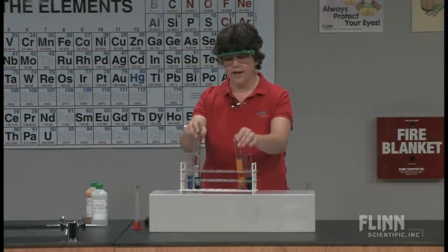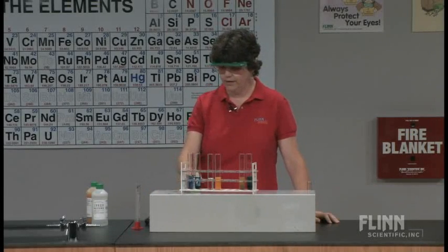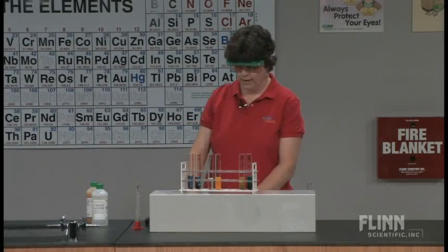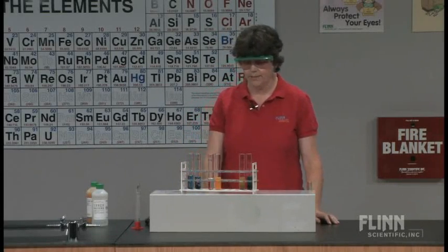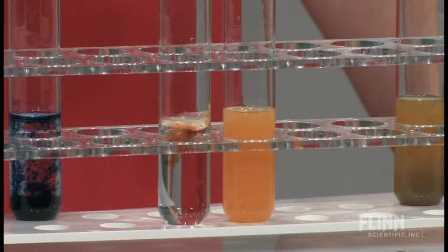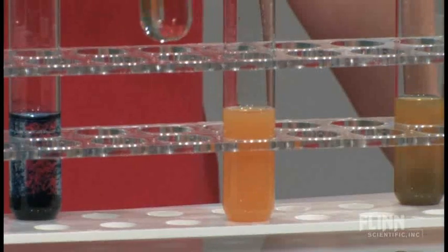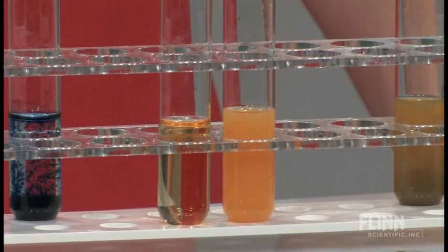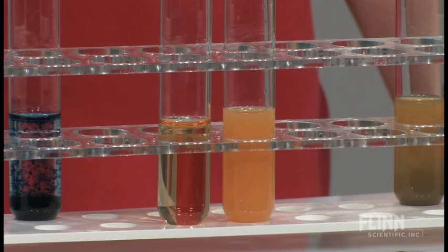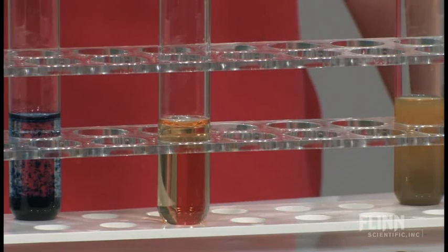Now another test we can do to see which iron ions we have is to use a thiocyanate. So I have here potassium thiocyanate. And if I put the potassium thiocyanate with the colorless Fe two plus, we're going to get, oh maybe a little bit of orange. A little bit of oxidation of the two plus to a three plus. But when I put the thiocyanate with the three plus ion, I get that classic blood red color of iron thiocyanate.